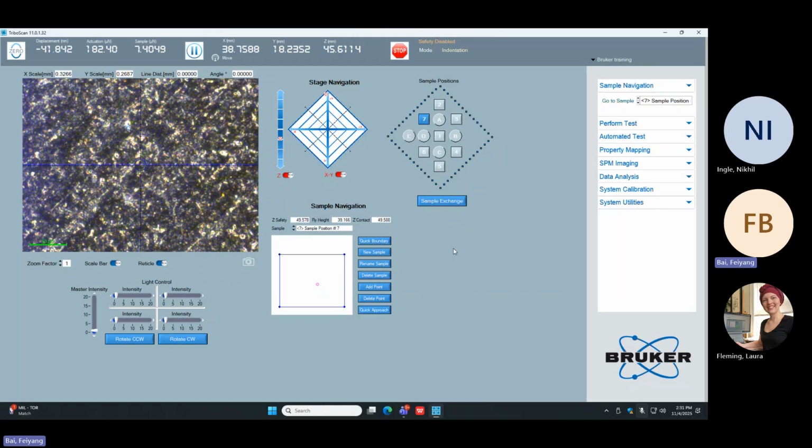I guess the position has a shape itself, so the software knows the boundaries. Can you repeat that? Yes. So this positioning, I guess it knows, like earlier, if you recall, the first one, we had to define the corners and everything to define the boundaries.